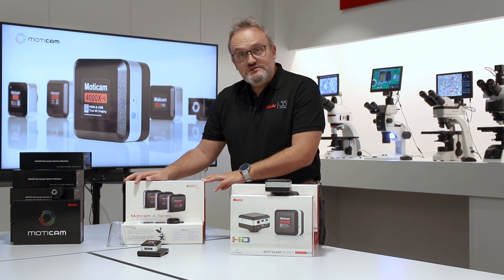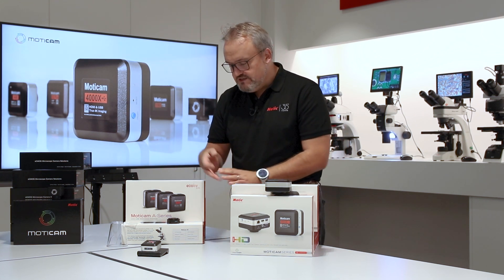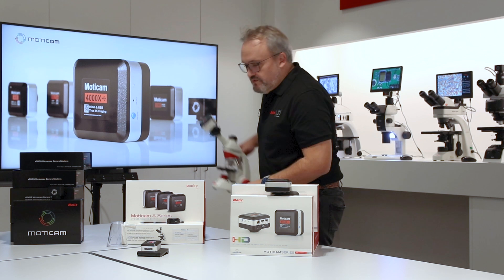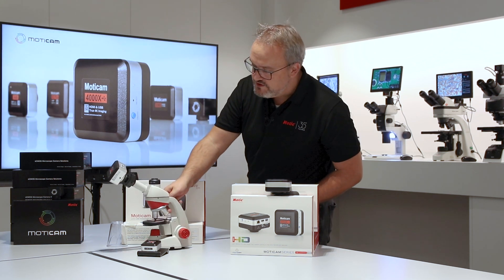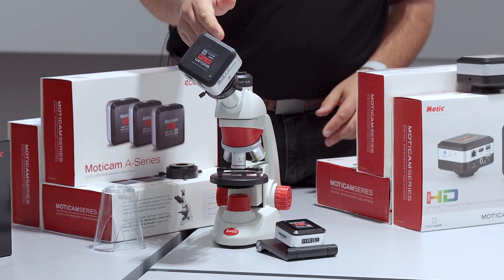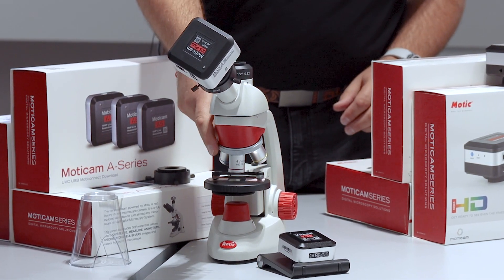The Moticam A-Series comes with all of the accessories that you need to attach it. We have focusable lenses and eyepiece adapters. Here is one I prepared earlier — we have one of these cameras connected to a monocular microscope with an eyepiece adapter with a focusable lens, all of which are included in the box.